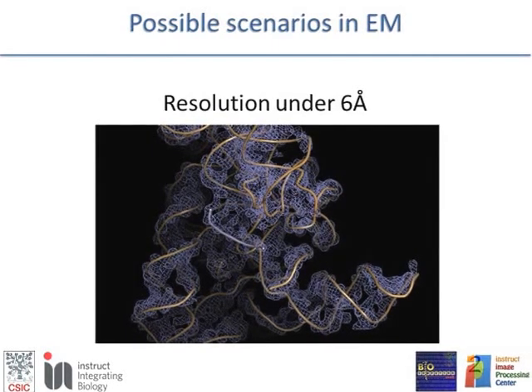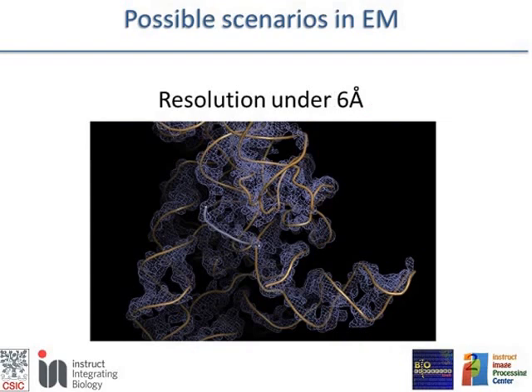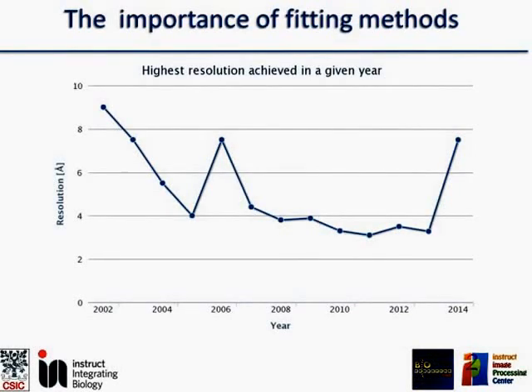I am going to focus this talk on protein fitting. So I am not going to explain methods for locating the secondary structure or tracing the backbone. So why are fitting methods important?